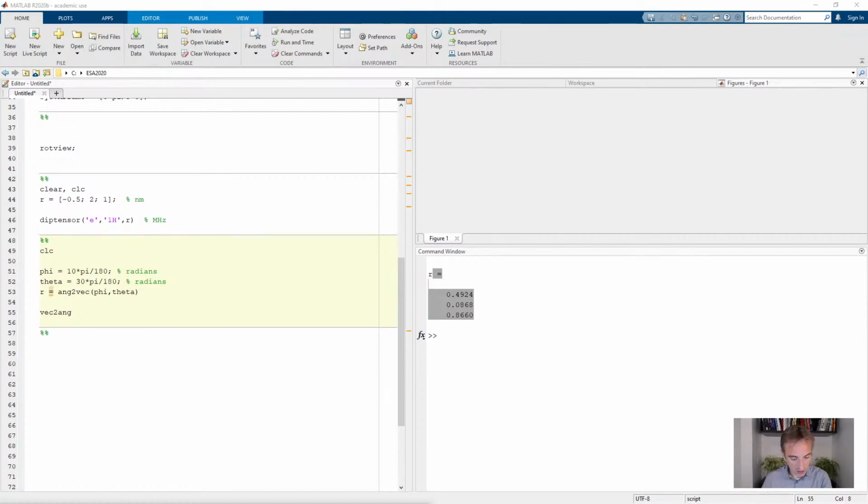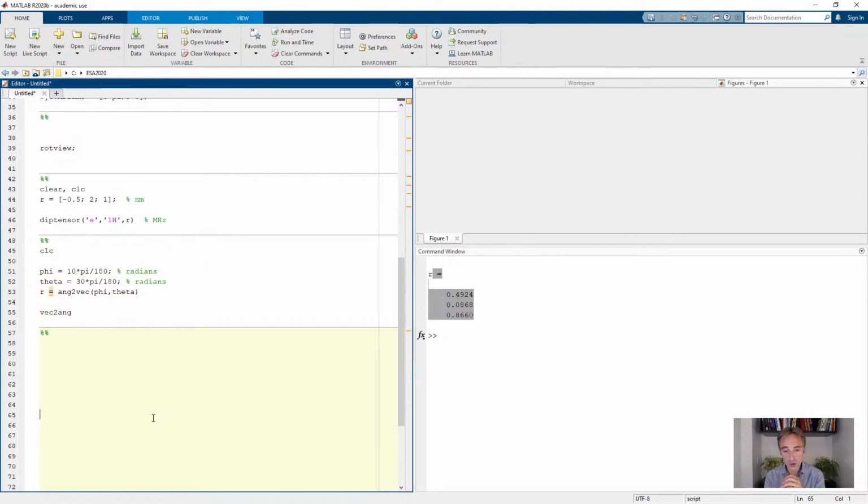I think the last thing I wanted to show in this demonstration is a utility that's useful for those of you who are doing crystal studies. So people who have samples that give spectra that depend on how you rotate your sample tube, right? And that applies to single crystals or also to oriented films. And EasySpin, especially EasySpin 6, has now much improved capabilities to describe these samples. Underlying that is this whole mathematics about rotation matrices. So here's a utility function that helps you rotate something around a specific axis.